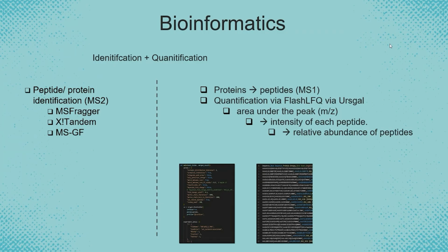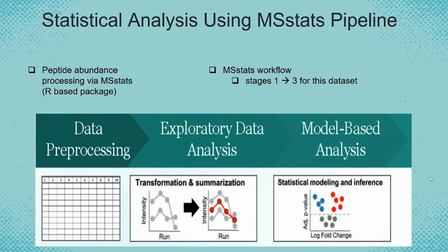And then for identification and quantification, we used the framework with FlashLFQ. For the quantification part of this, an MSstats pipeline was used.